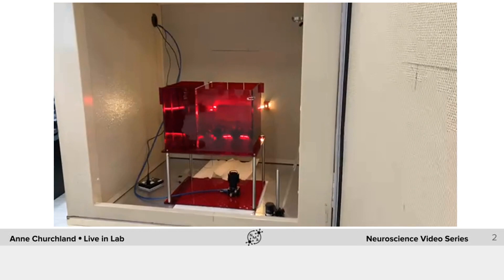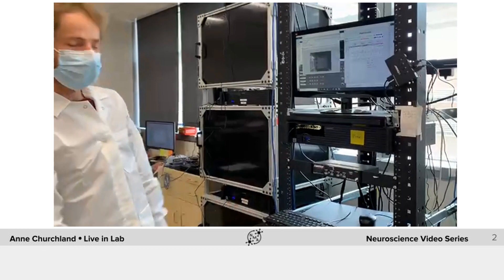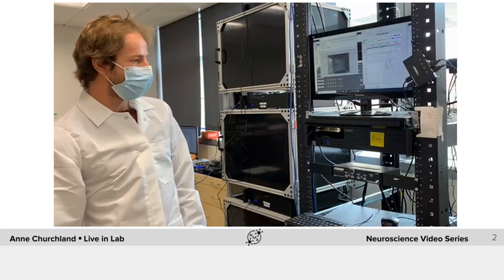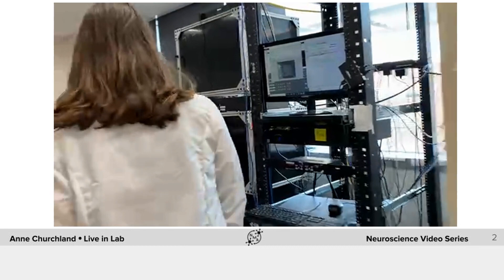And you can see here also this is the computer which is the core computer rig which is the core element to control behavioral stimuli and behaviors. And you'll see more of this later. Thanks Lucas.